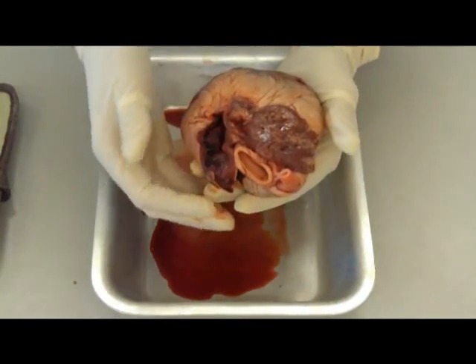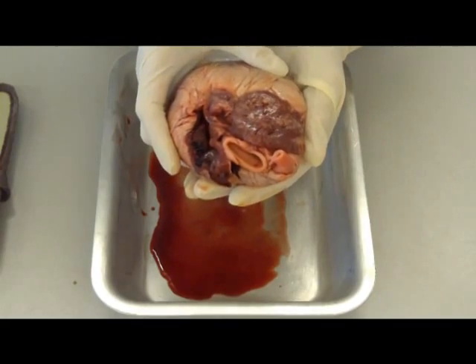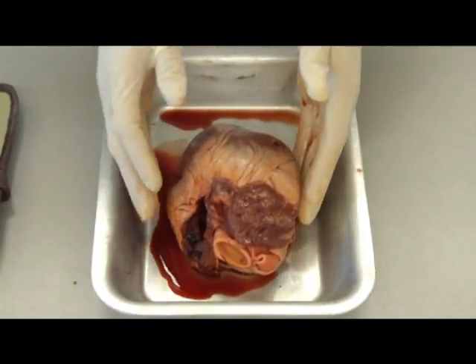You've also got blood vessels that you can see at the top here - arteries and veins which take the blood to the different parts of the body. That's what the other side of the heart looks like. And now we'll look at actually cutting open the heart.